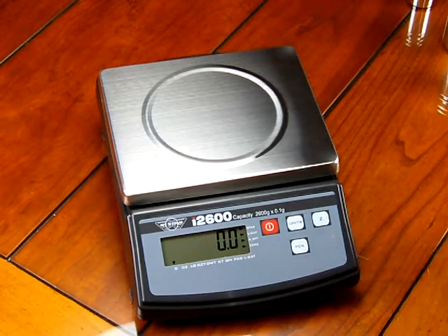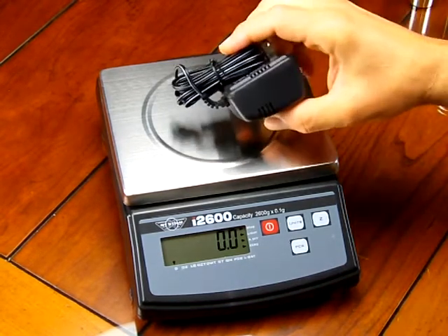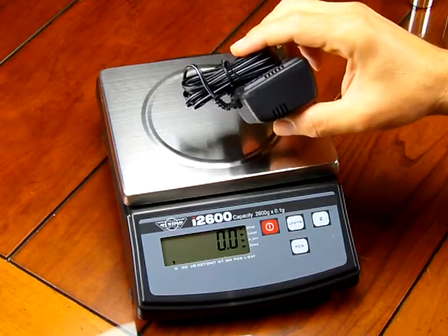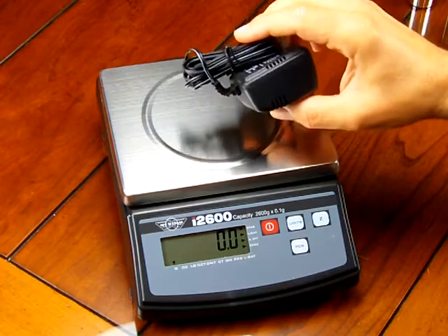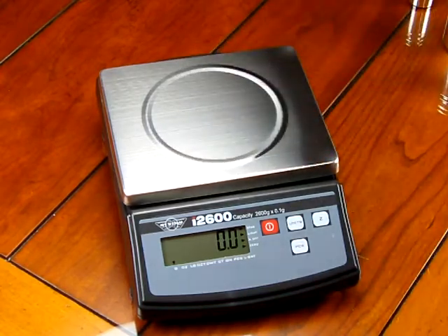We've powered up the scale and it is running off of batteries. The scale does come standard with the AC adapter, so the AC adapter is not an optional accessory. Some manufacturers don't include the adapter, but MyWay does include it on the i2600. So you have the ability to run off an AC adapter or battery power.